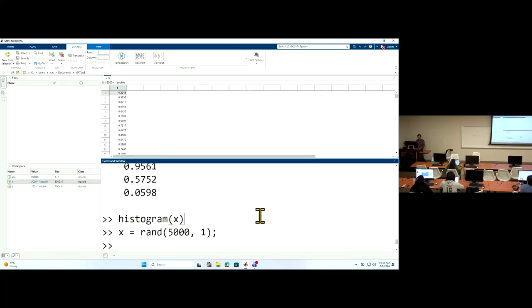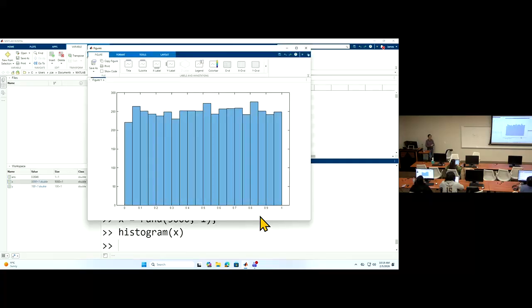So in this case, if you do this histogram again, you start to see the program is smart enough, because you have enough samples for each bin. It starts to create denser bins and allows you to see the distribution of the sample frequency within each bin.